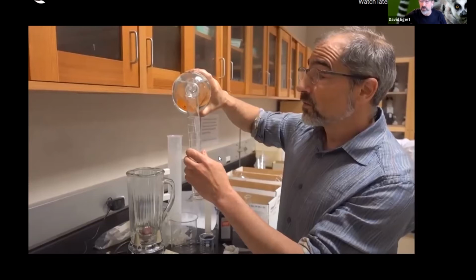Why is that going to be important? Hydrogen peroxide is acidic. You can denature the enzyme if the pH isn't stable and it could affect the experiment. Right, exactly. It's like sources of variability. What are sources of variability? It's like, is our enzyme healthy? Is our enzyme getting denatured? Any condition that denatures the enzyme is going to totally mess with the experiment, right?